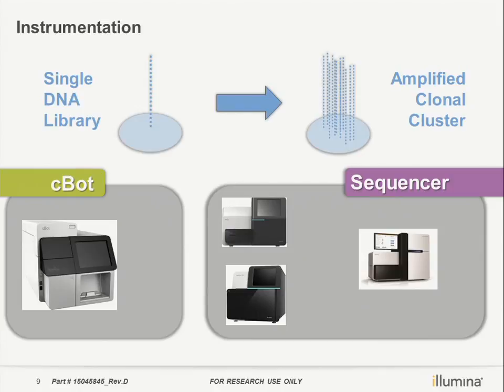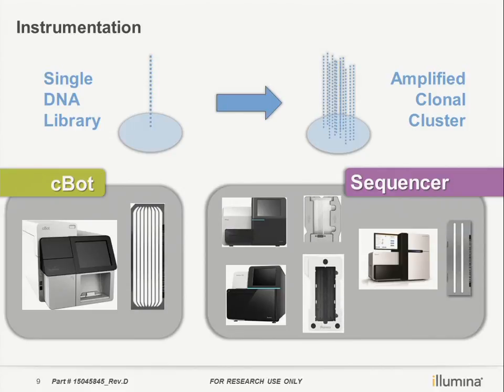Okay. So in the NextSeq here, and MiSeq, the cluster generation is on board. So the instrument will perform the cluster generation process for you. But if it's on the HiSeq, then we need another instrument called cBot to do the cluster generation process. So what we do is try to amplify the signals so that we can capture it. If we don't do this step, you can imagine that the requirements for the optics will be very high. So it would be very expensive to do that.